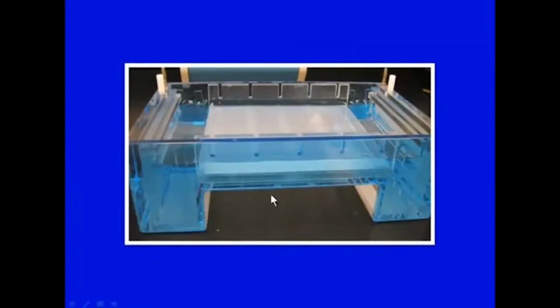This is a typical horizontal gel electrophoresis apparatus for running the agarose gels. As you can see, here there is a tank where buffer is put, and there will be 2 electrodes, one positive and one negative. The agarose gel is placed in here, and then a sample will be loaded. We have discussed earlier that wells are created and the sample is loaded, and the DNA will run towards the positive electrode.